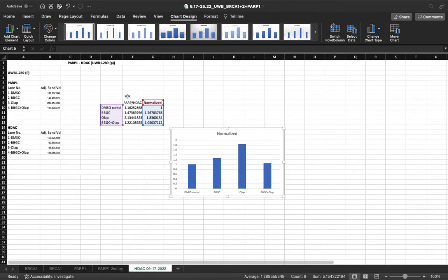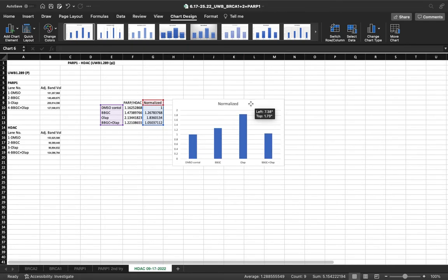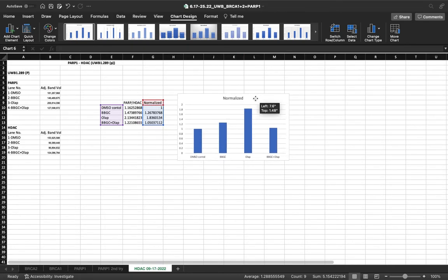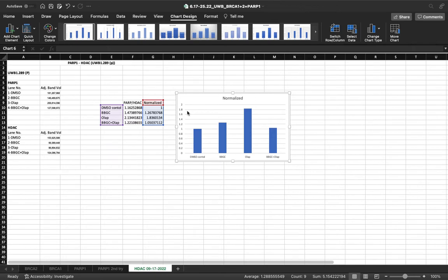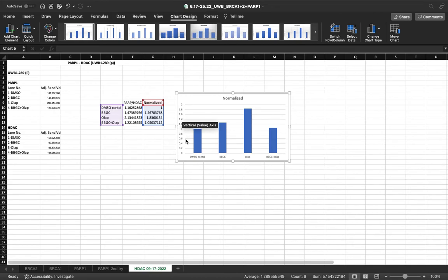There we go. I recommend adding axes titles and chart titles.